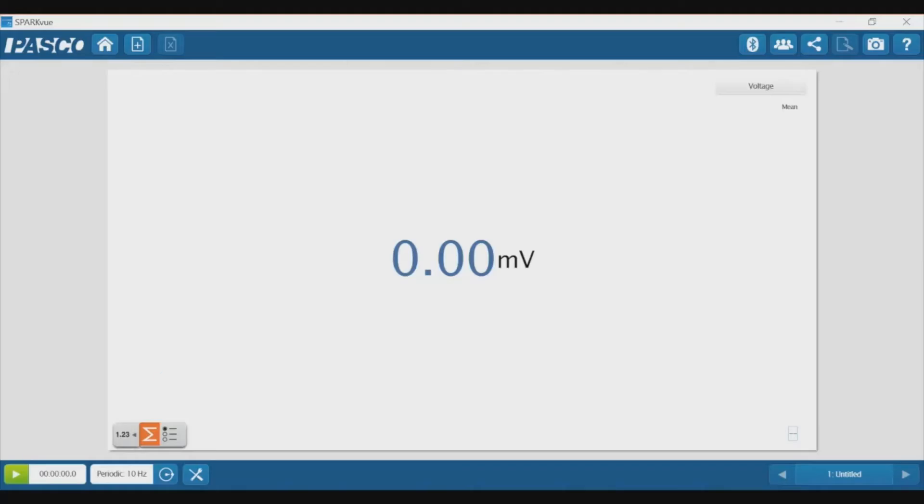Now press the play button to begin and collect data for about five seconds and press stop. You'll repeat this process, just selecting play, collecting data for five seconds and stopping, three times for each of the cells that you create.